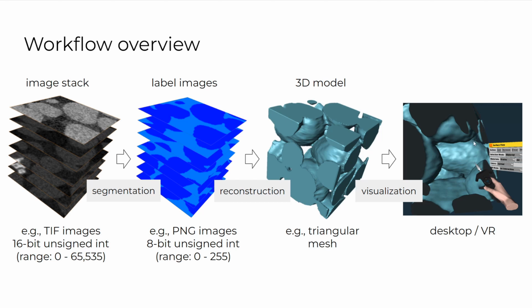Okay, so from this point onwards, I want you to keep a mental picture of this slide, because we will keep going back to the terminology we discussed here throughout the workshop.